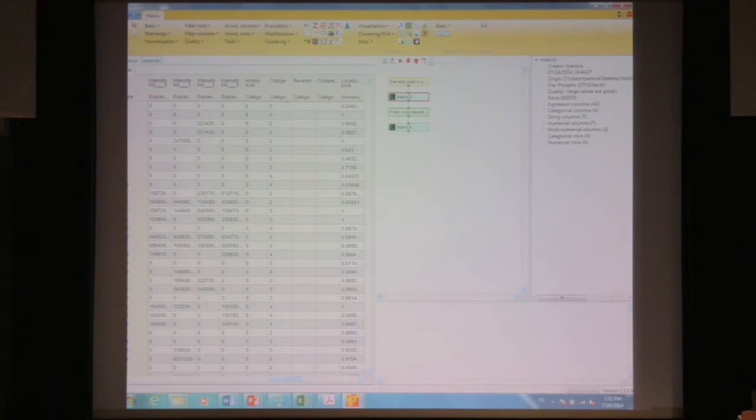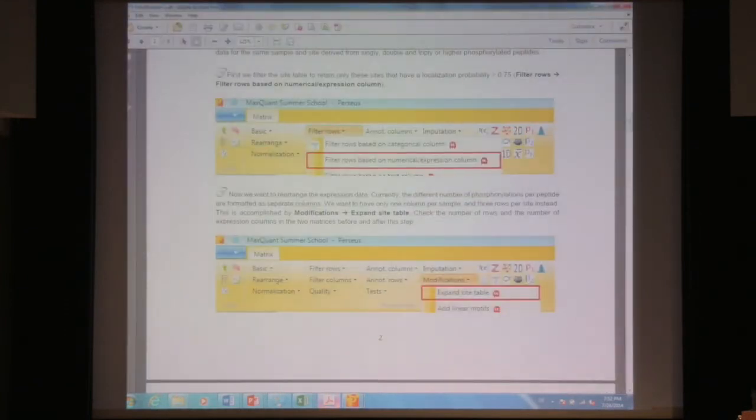So in that case, maybe follow along with me rather than the manual here specifically, because some steps that I'll do will be faster in the order shown live. If you want to do it later on, you can follow along here. The same steps are in here that I will do, not necessarily in exactly the same order. Okay, so we've filtered the reverse.